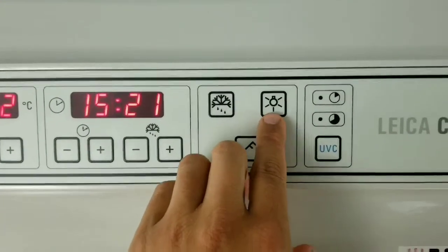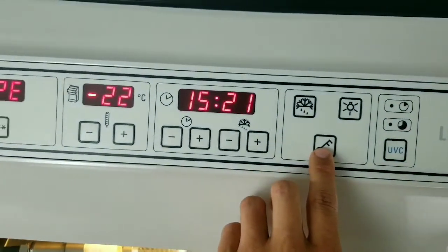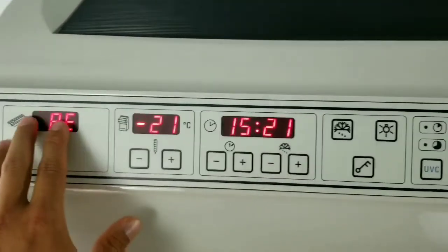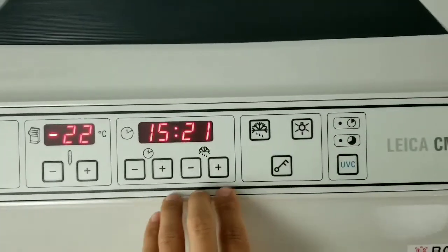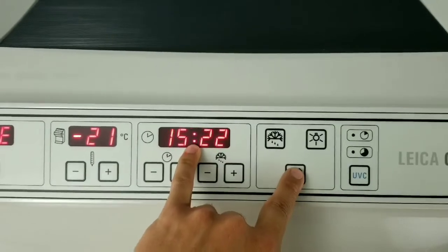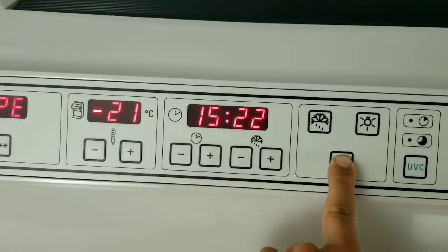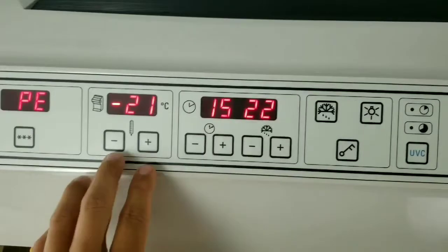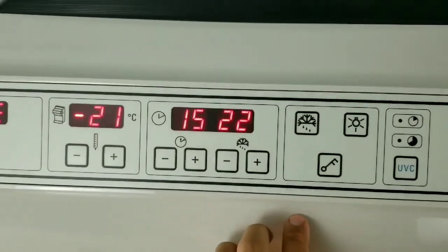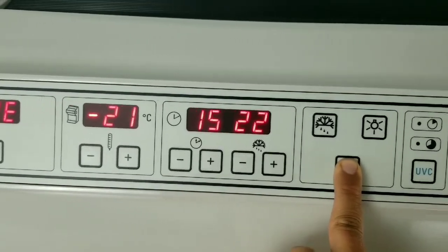This is your cryo chamber light, and this is your lock button. When you press and hold it for 5 seconds, it will lock this display so you cannot change any of the parameters here. The way you know it's locked is if the colon in between the time goes out and it's not there anymore. To unlock it, press and hold it for another 5 seconds, and that colon should come back and it should be responsive again.